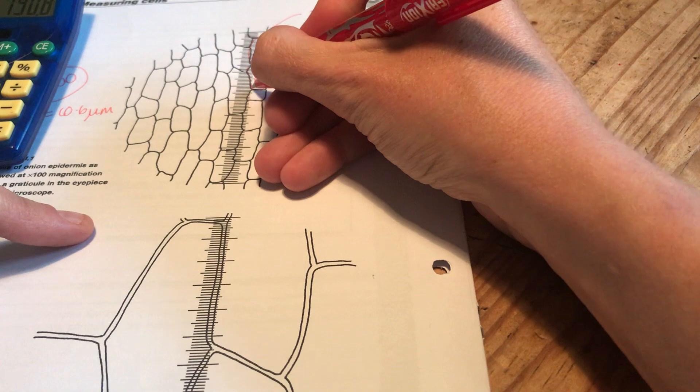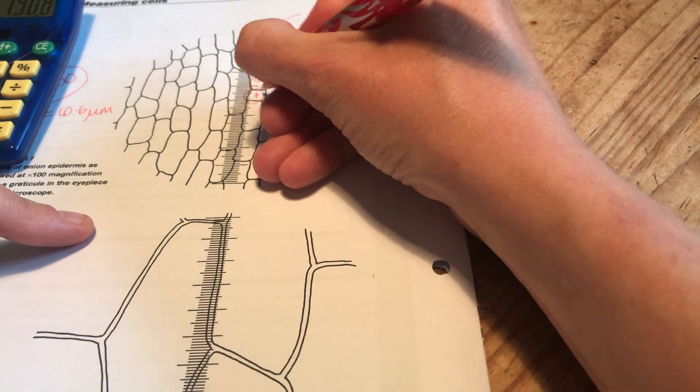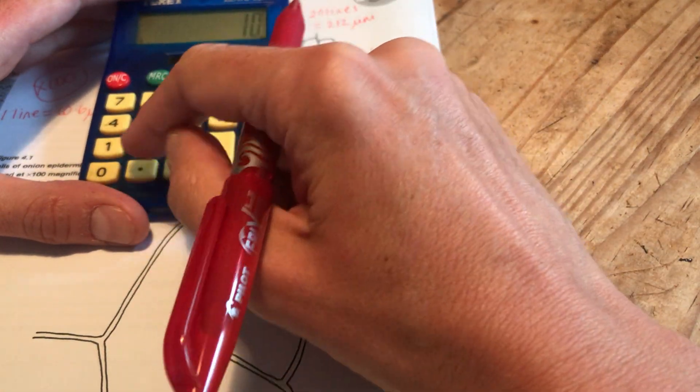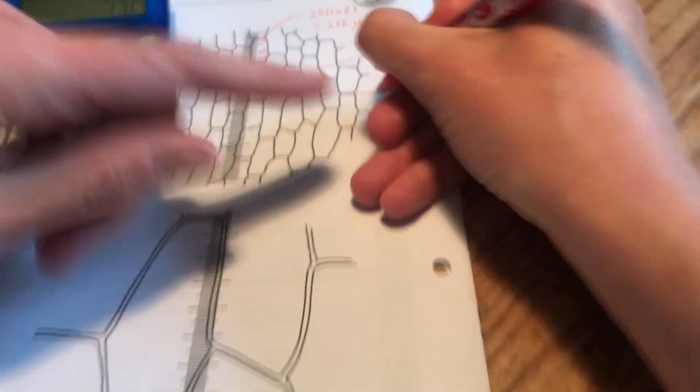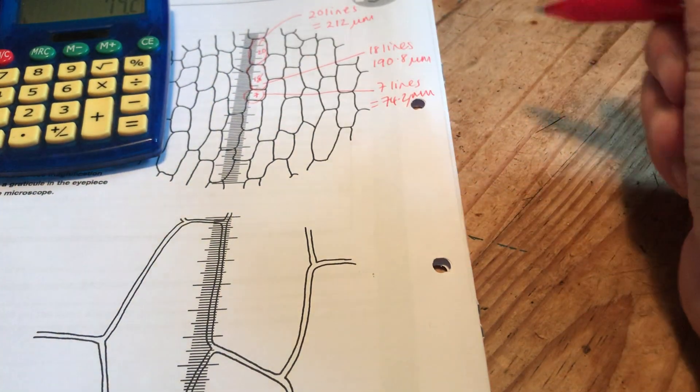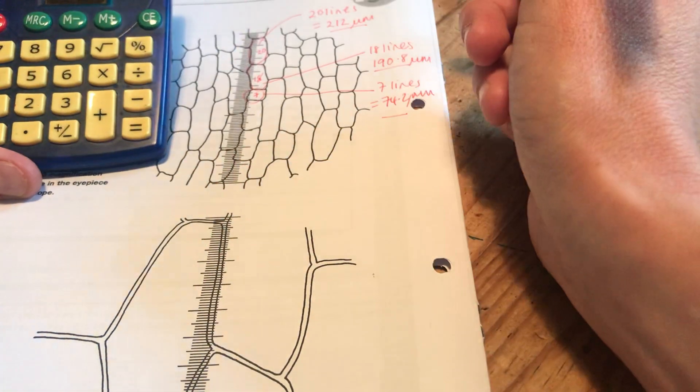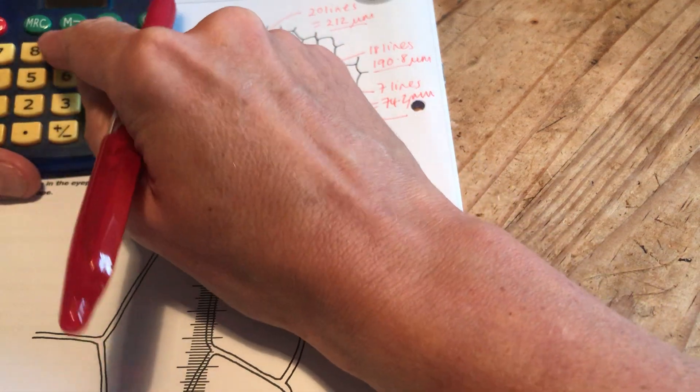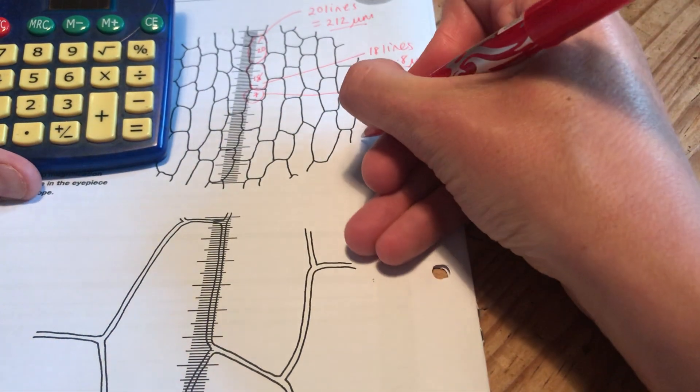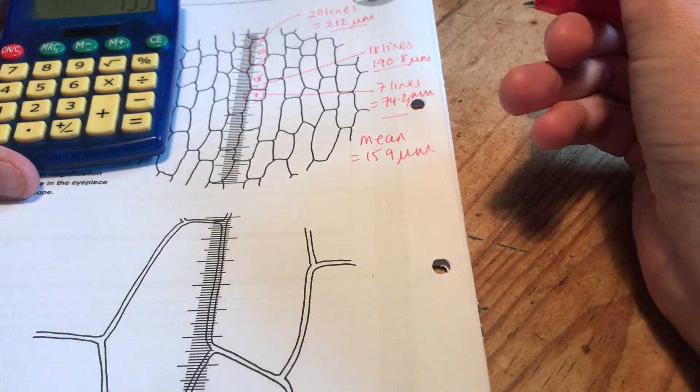I could do this little one here. One, two, it's kind of hard to look over my phone. Is it about seven? So this is seven lines and I know each line is 10.6. So I say this cell is 74.2 micrometers. I could keep going and doing loads of those but let's just say I've done three. I could take a mean of those three lengths there. So let's say I've got 212 plus 190.8 plus 74.2 divided by three. So my mean is 159 micrometers. That's one way of doing that.